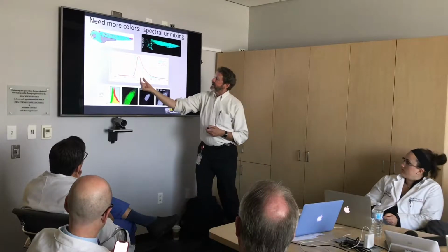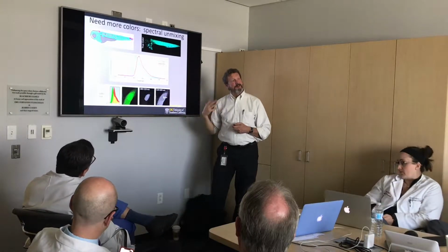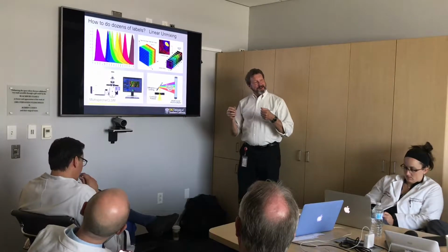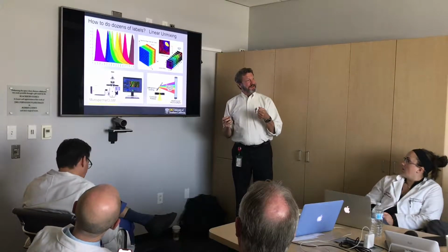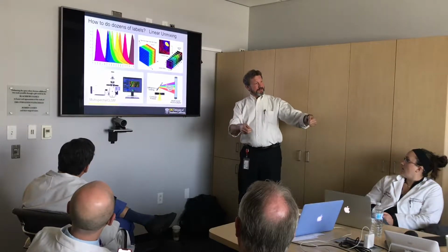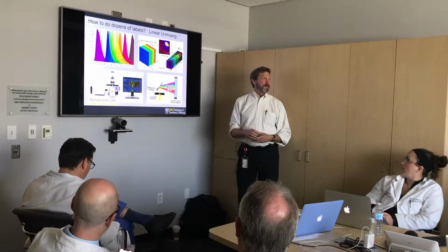The problem is that there's almost nowhere here where you could just get the GFP or just get the YFP signal. In fact, there's probably nowhere. So again, complaining at the Athenaeum at Caltech, somebody from JPL started laughing at me, and they said, well, all of our signals overlap. We do not, with a satellite, put a giant blue filter in front of the sun and irradiate the Earth with only one color and then take a picture. We have to take what comes back.